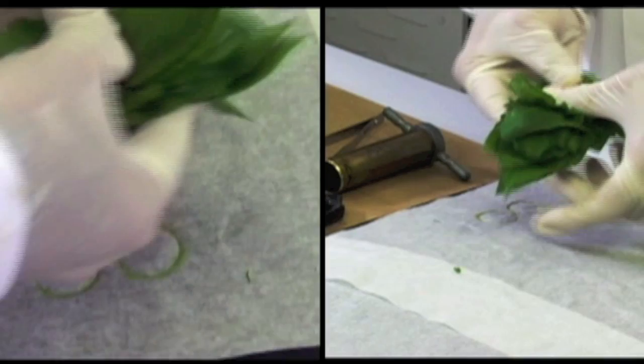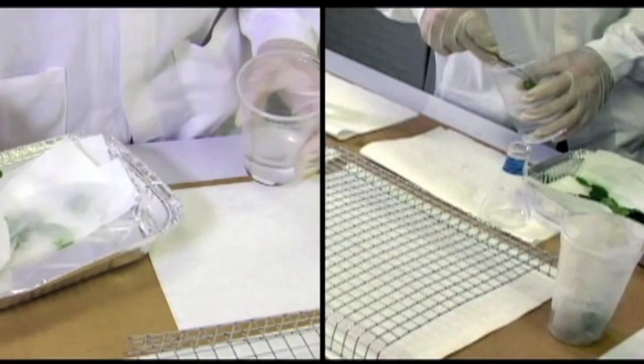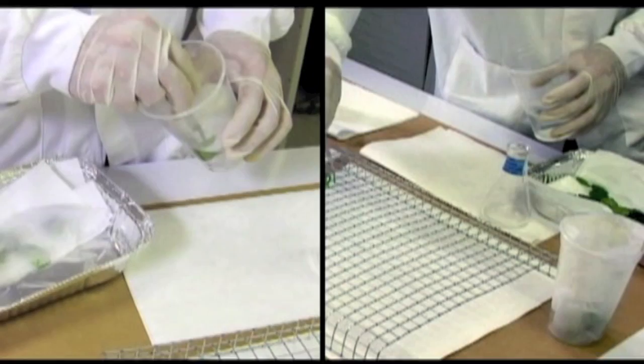Ideally, leaflets should be cut into leaf discs with a standard leaf area of around 2.5 centimeters diameter, or 4.91 square centimeters. Each leaf disc should be dipped for three seconds, swirling gently to make sure that the whole leaf area is well covered.